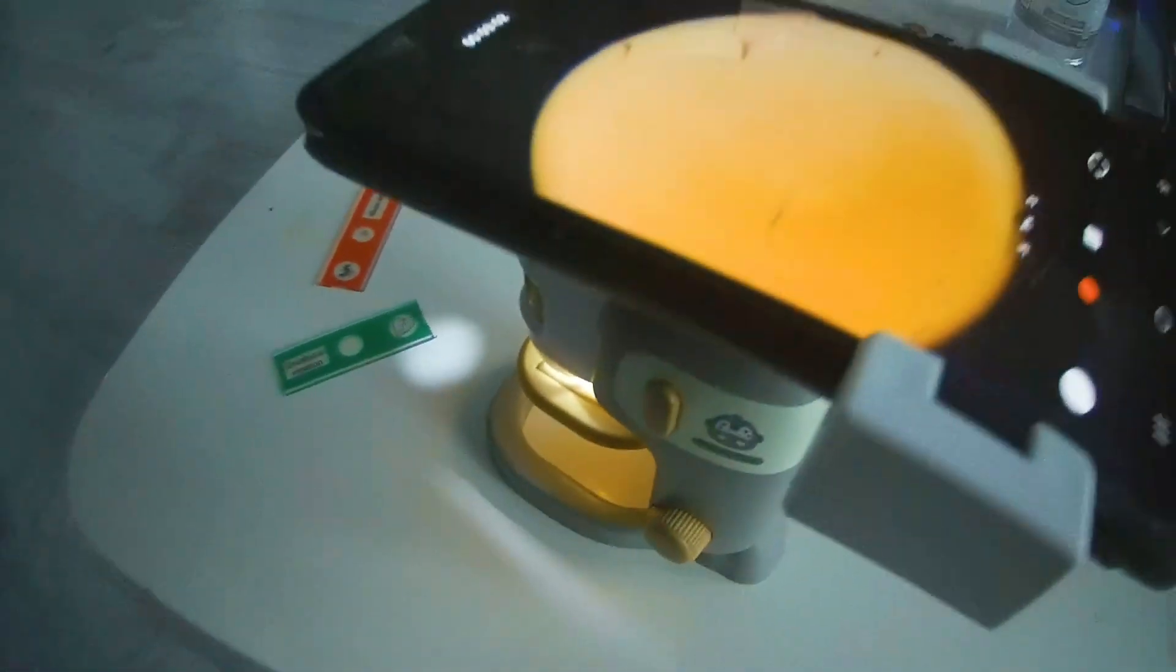And when you're ready to go on a field trip, press those two buttons, and you have an independent microscope. And this little area is for the lanyard. So then you can hang this and carry it with you anywhere you want outside.